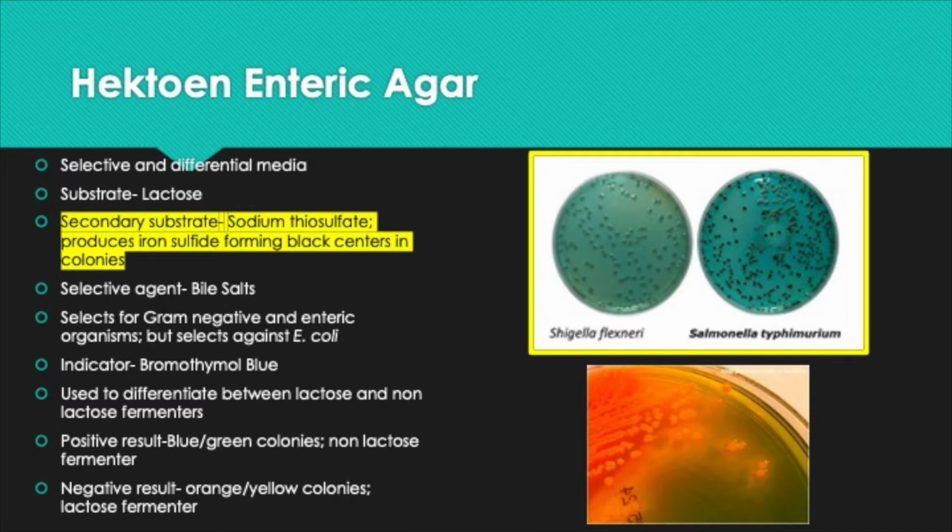So it's a little bit different. It's still food poisoning, but it's just a different form from Salmonella. And it's an enteric bacteria, so it's coming from drinking feces contaminated water, okay? So that's the reason why we look at the H2S production. If H2S is produced, you're going to get the black colonies, okay?